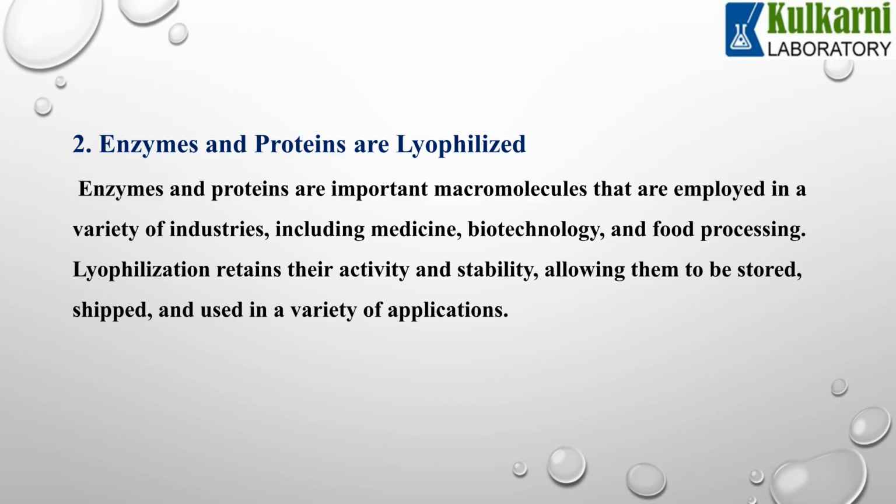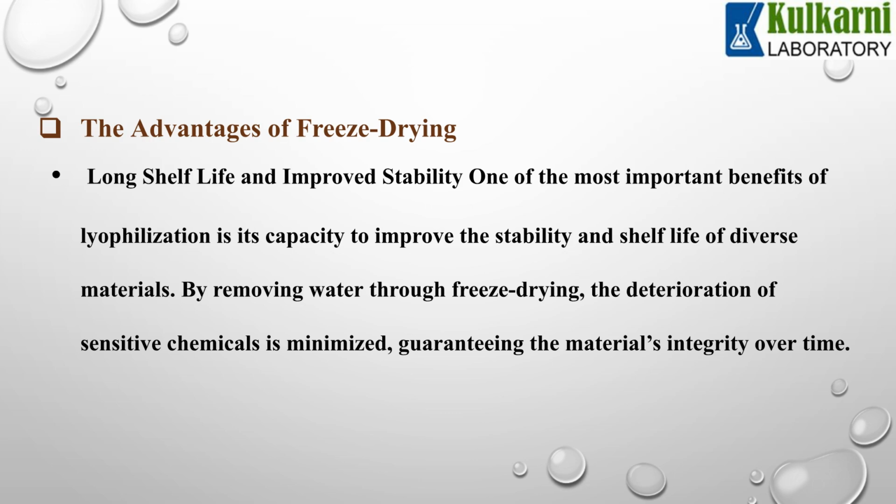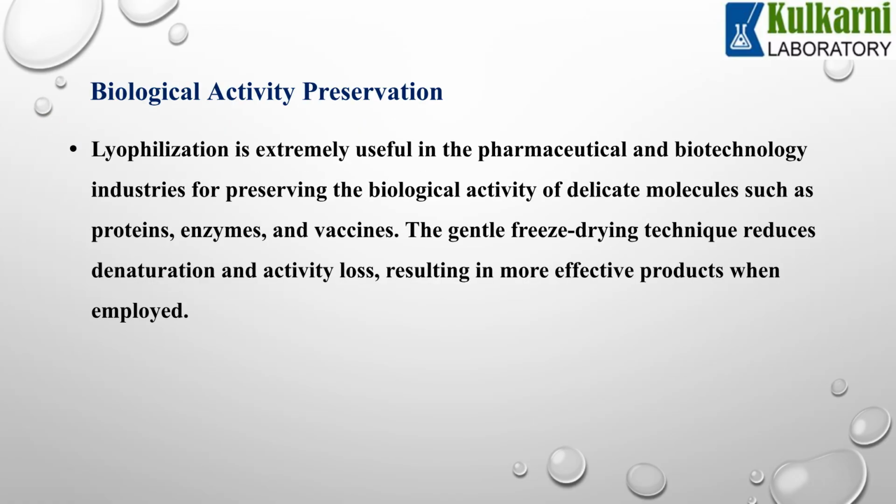Enzymes and proteins are critical macromolecules in medicine, biotechnology, and food processing. Lyophilization preserves their activity and stability, enabling storage, shipping, and usage in various applications across these industries. One major benefit of freeze-drying is a long shelf life and improved stability. By removing water, lyophilization minimizes the deterioration of sensitive chemicals, ensuring the material's integrity over time.